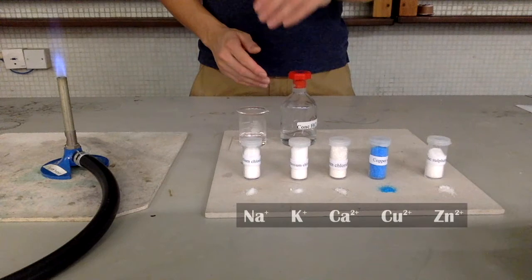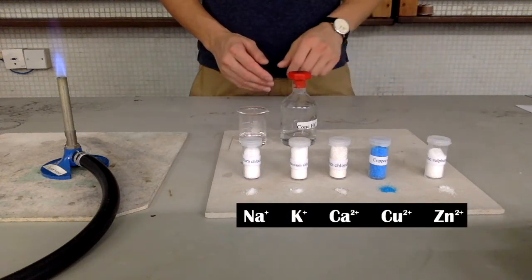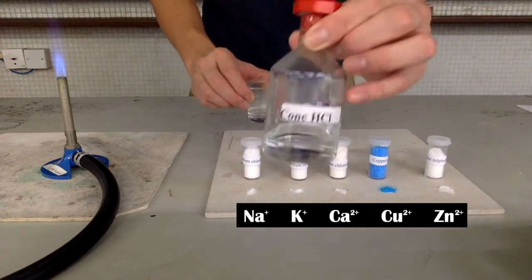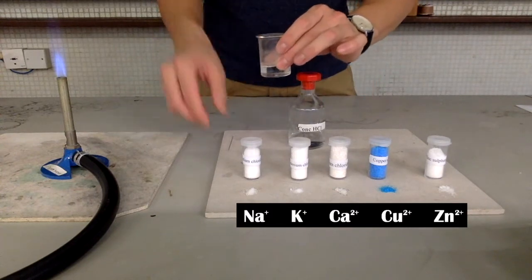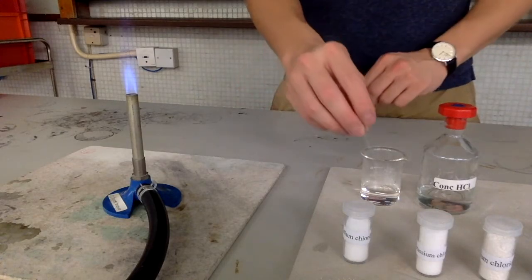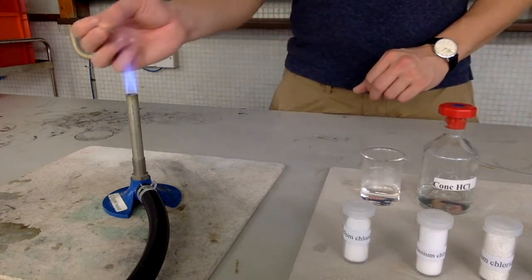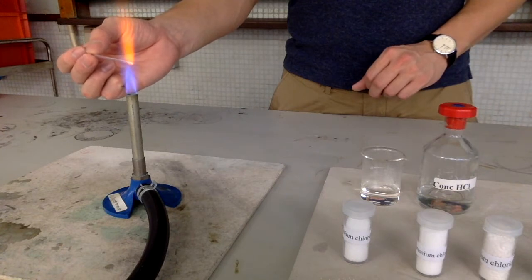Samples of sodium ion, potassium ion, calcium ion, copper 2 ion, and zinc ion were prepared. Pour concentrated hydrochloric acid into a beaker. Prepare a flame test rod. Clean the flame test rod by putting it into concentrated hydrochloric acid and heat it with Bunsen flame. Make sure that there is no characteristic flame color.